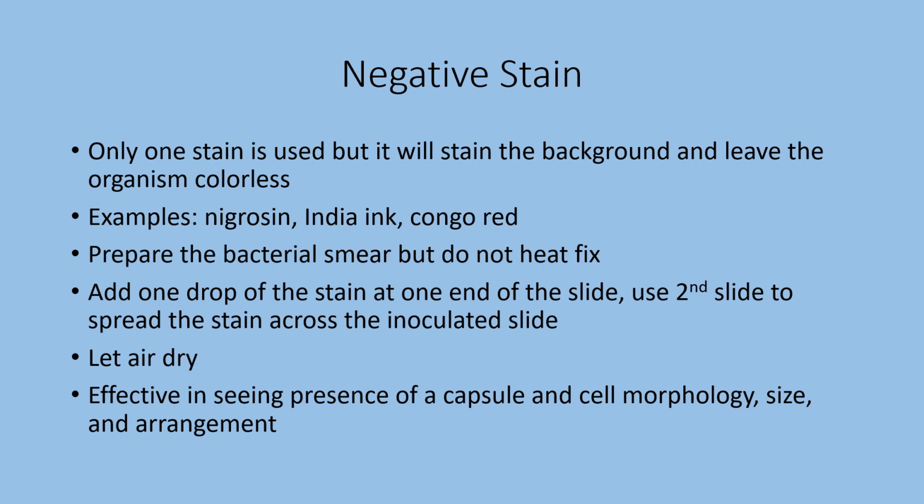Like I say, the background will be dark, and the cells will be colorless. You will be able to determine cell size. You can determine the cell morphology, or the shape of it. You can determine arrangement, all those things just like a regular simple stain.